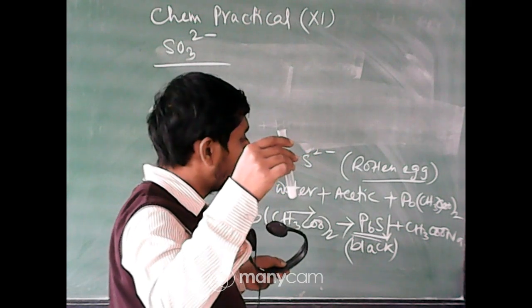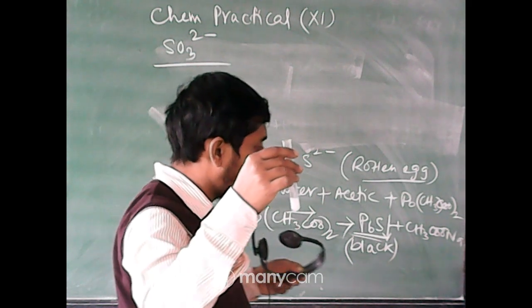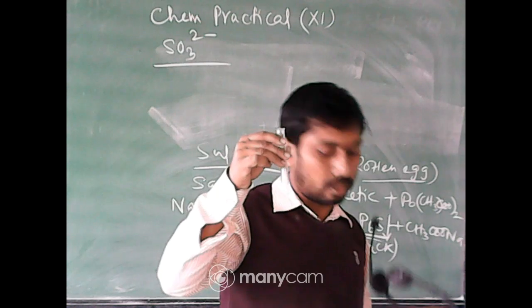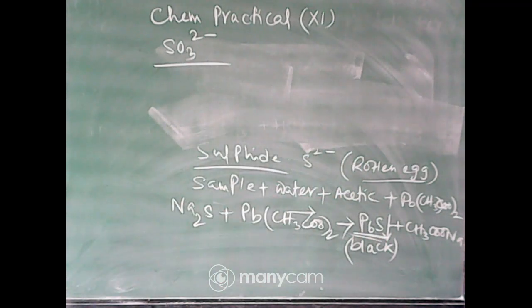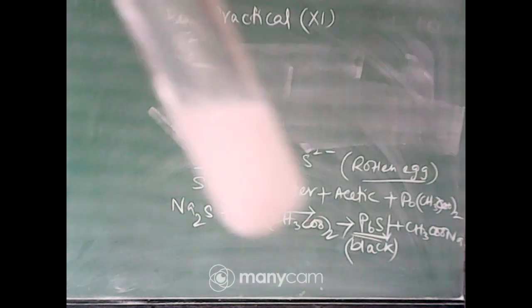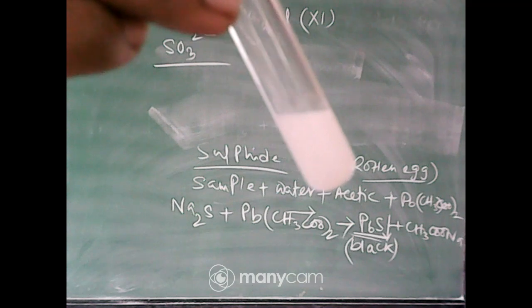This practical is common for class 11 and also class 12. Inorganic practical, this one. So just follow that. The white PPT is formed. This is the white PPT. Clear?